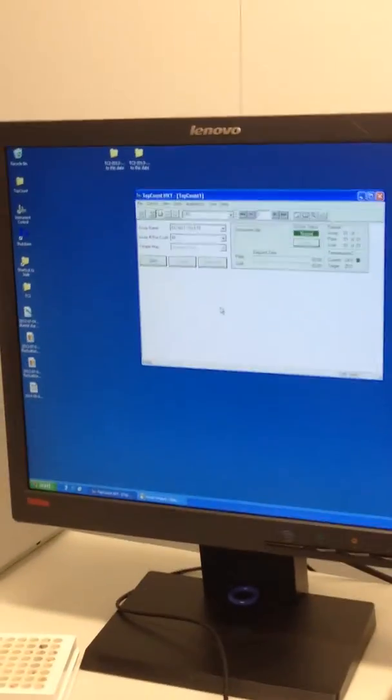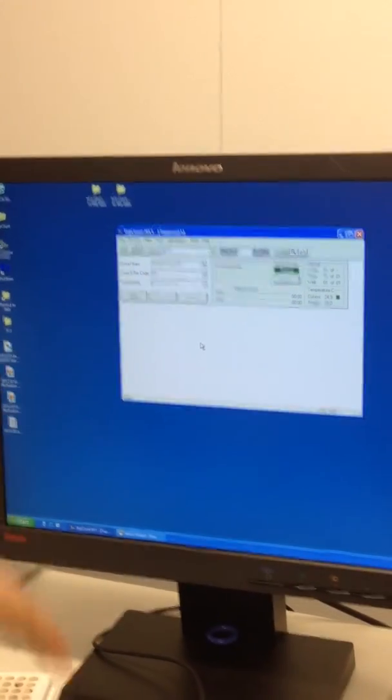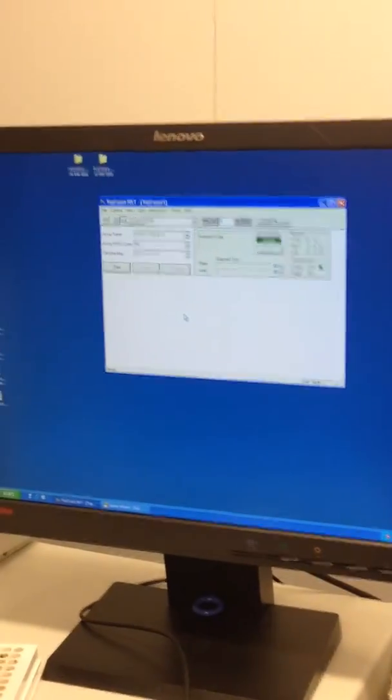There are two ways with which you can do a calibration. One of them does not work anymore, we don't know why. And it says here, the hand with the plate, it means you manually provide the plate. Doesn't work, don't use it. Use the one with the stacker option, okay? And that's why it's important to put a stacker in the back.